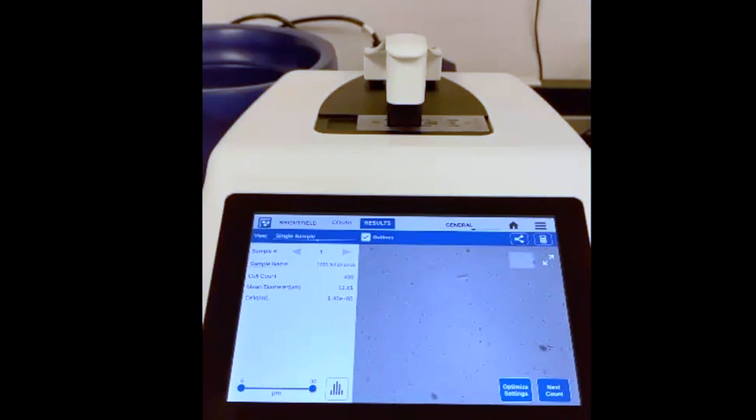The emission wavelengths are 525 plus or minus 25, and 640 plus or minus 35. That's the excitation and emission. It works well for fluorescein, acridine orange, GFP, propidium iodide. A lot of different dyes are covered in those excitation and emission spectra.